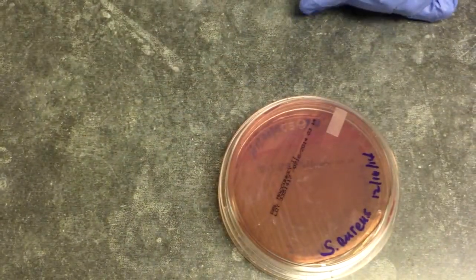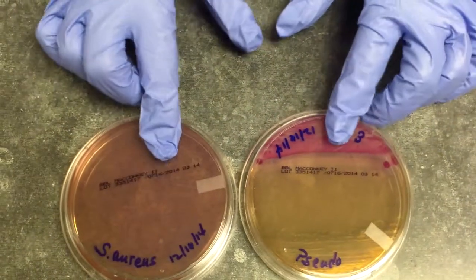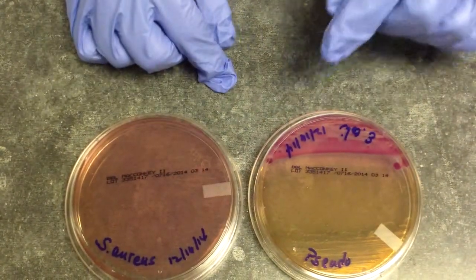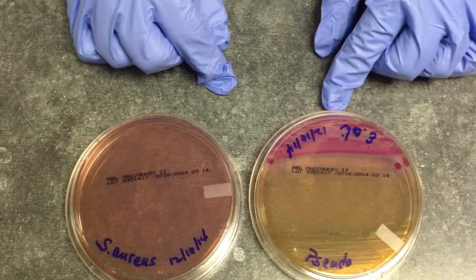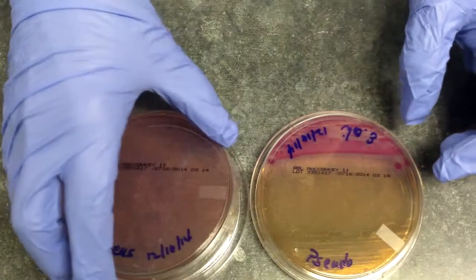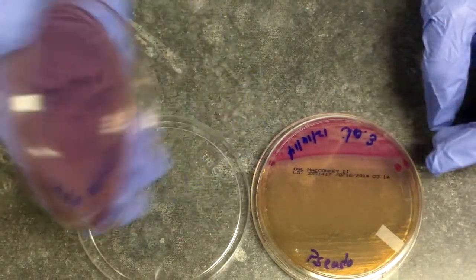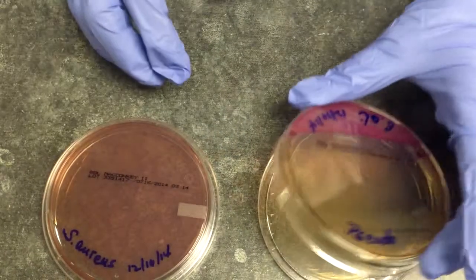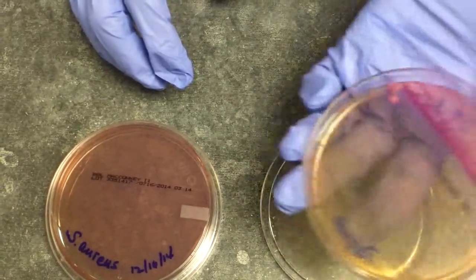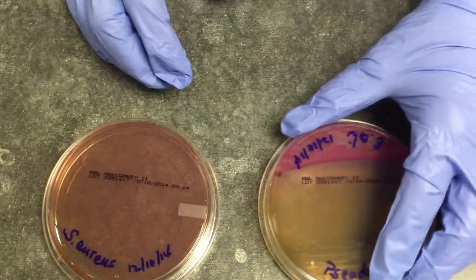Next, we have another selective medium, which is our MacConkey agar. And the MacConkey agar will allow our gram-negative organisms to grow and inhibit our gram-positive organisms. And you can see that the Staph aureus on the MacConkey agar did not grow, but we do have gram-negatives of E. coli and Pseudomonas, which have grown very well.